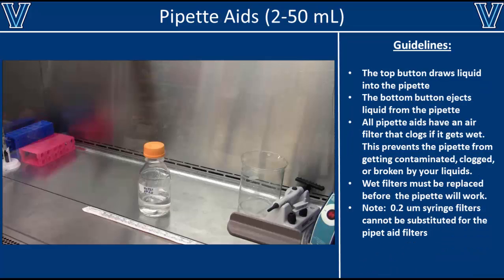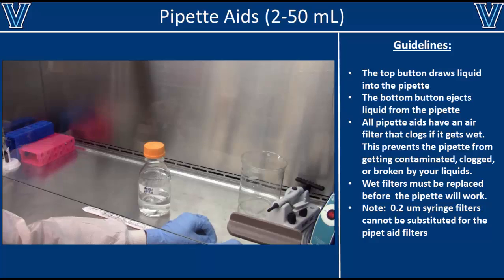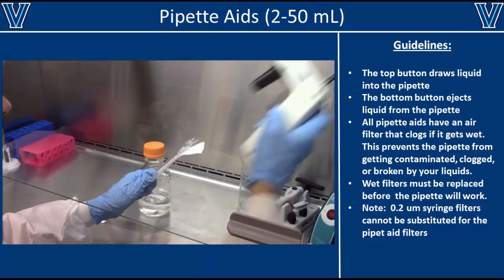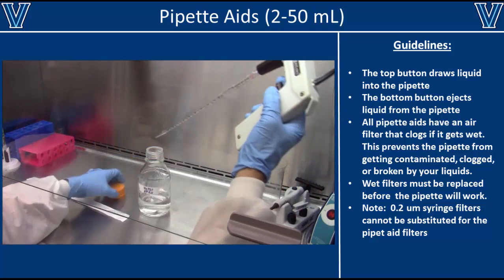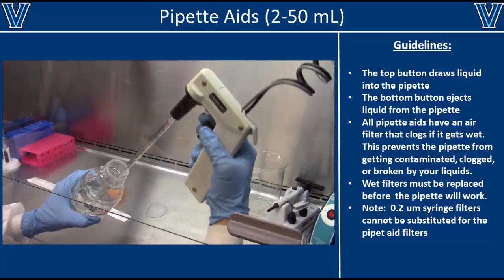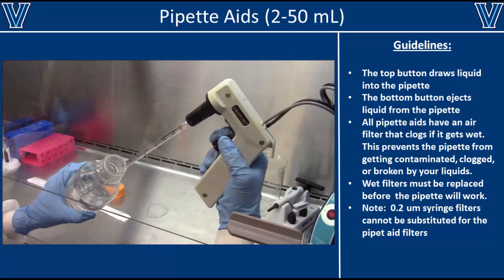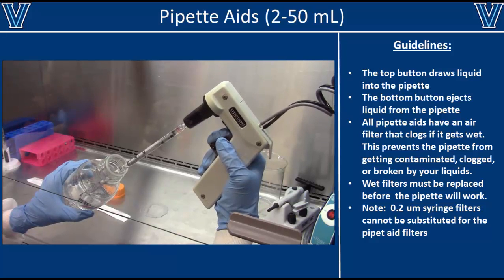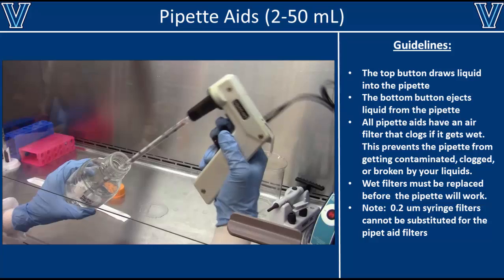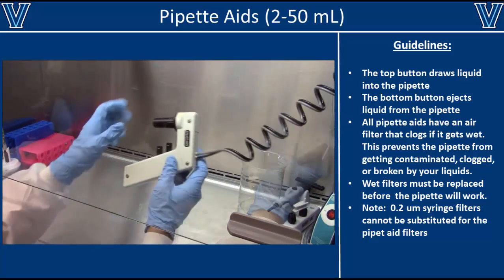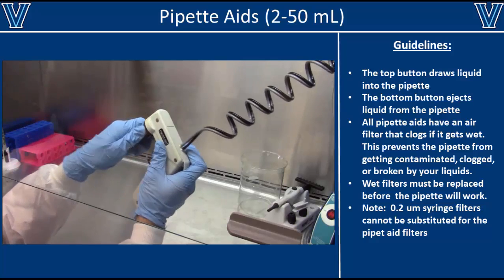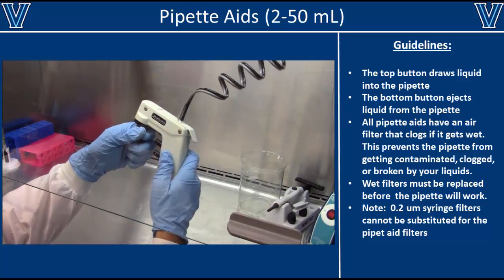If you need to transfer volumes larger than 1 ml, you'll need to use a pipette aid. Pipette aids use much larger tips with volume ranges from 2 to 50 ml. Begin by tightly inserting the tip into the pipette aid, then submerge the tip into the liquid. Draw liquid up with the top button and eject liquid with the bottom button. If at any point you draw liquid too far up, the pipette will stop working. This is because all pipette aids use an air filter to protect themselves from liquid contamination.